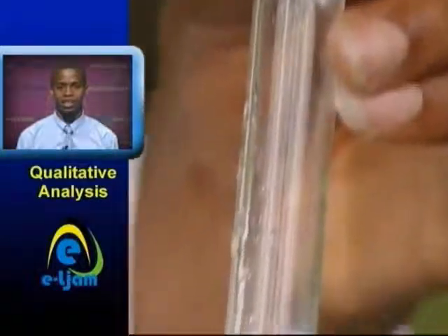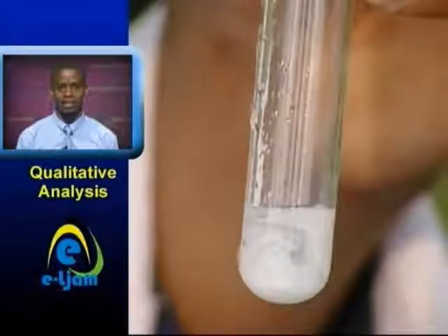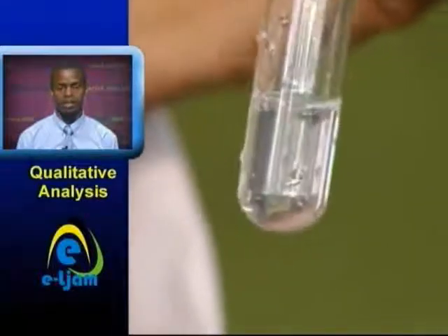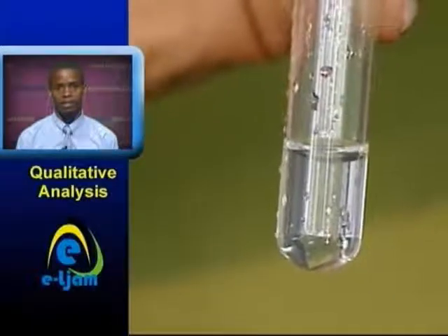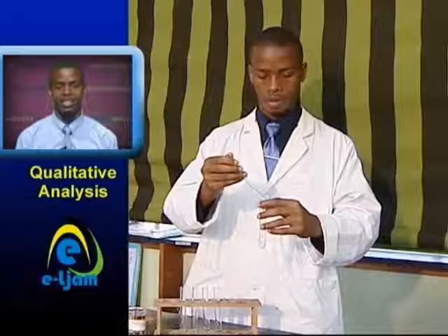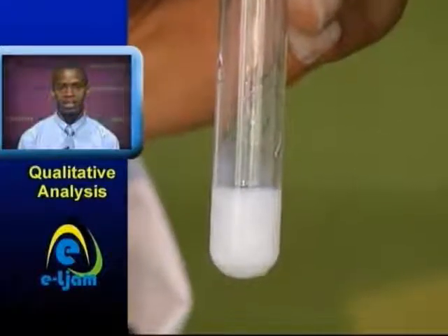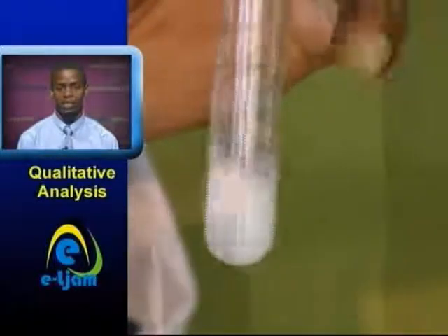Then, using a dropper, add sodium hydroxide solution dropwise to see if a precipitate forms. The next step involves adding excess sodium hydroxide solution to see if the precipitate dissolves. If no precipitate forms, warm gently and test for ammonia. To another portion of the solution, add aqueous ammonia drop by drop and look for precipitate. Again, add aqueous ammonia in excess to see if the precipitate dissolves. If required, carry out a confirmatory test on another portion of the solution.